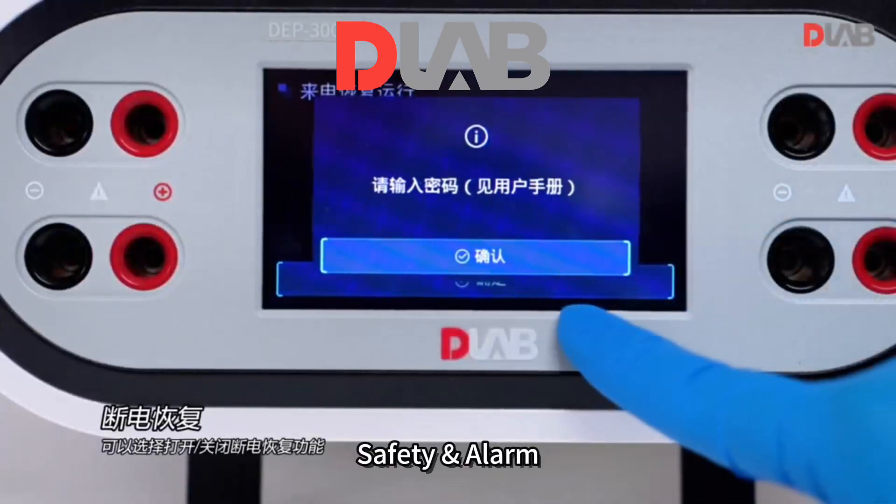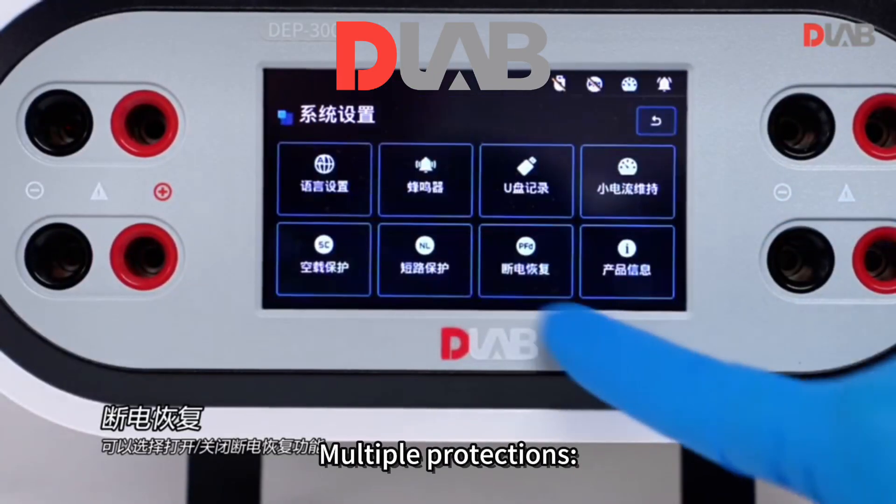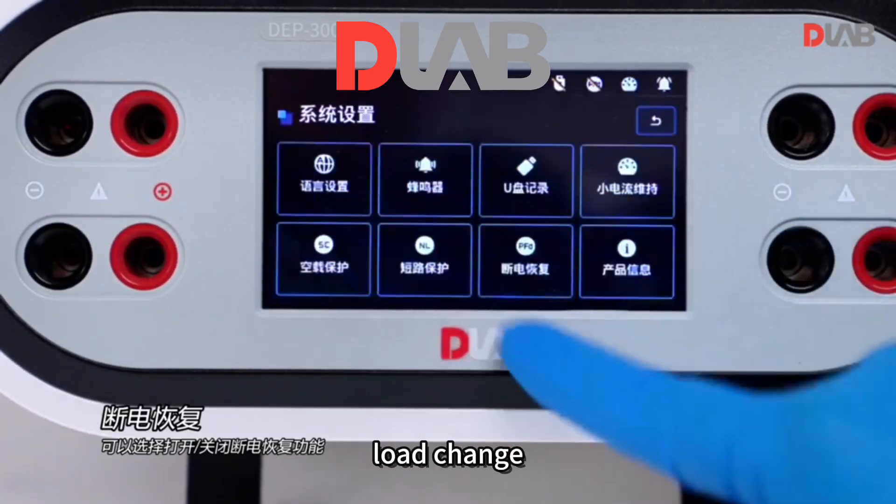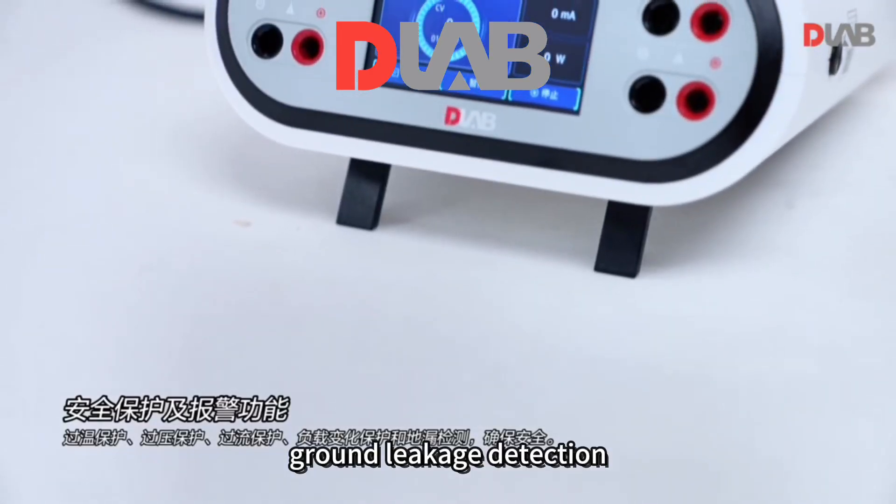Safety and alarm: multiple protections including over temperature, over voltage, over current, load change, and ground leakage detection.